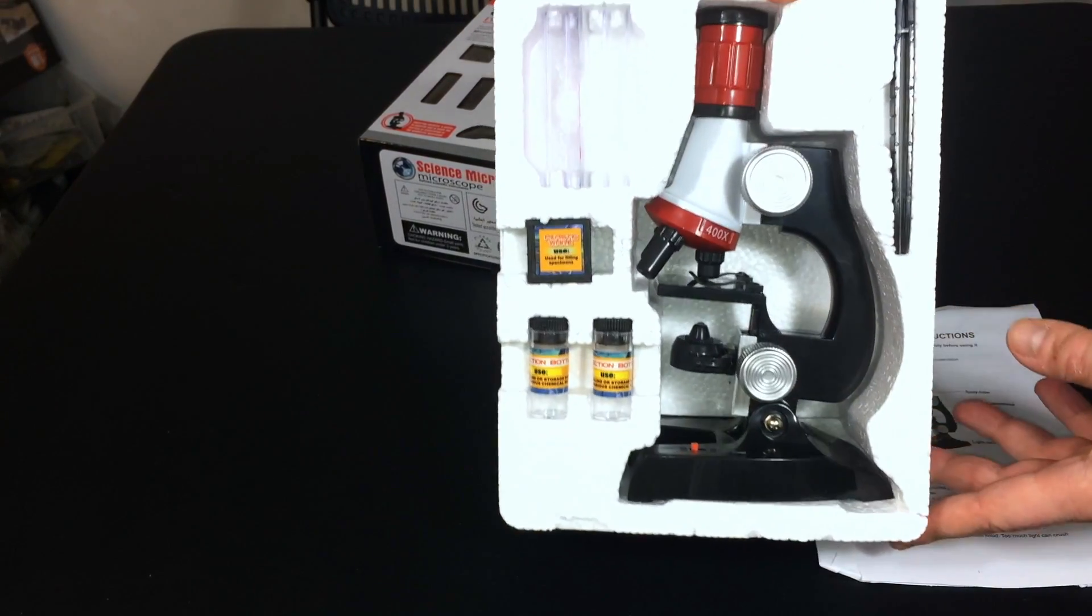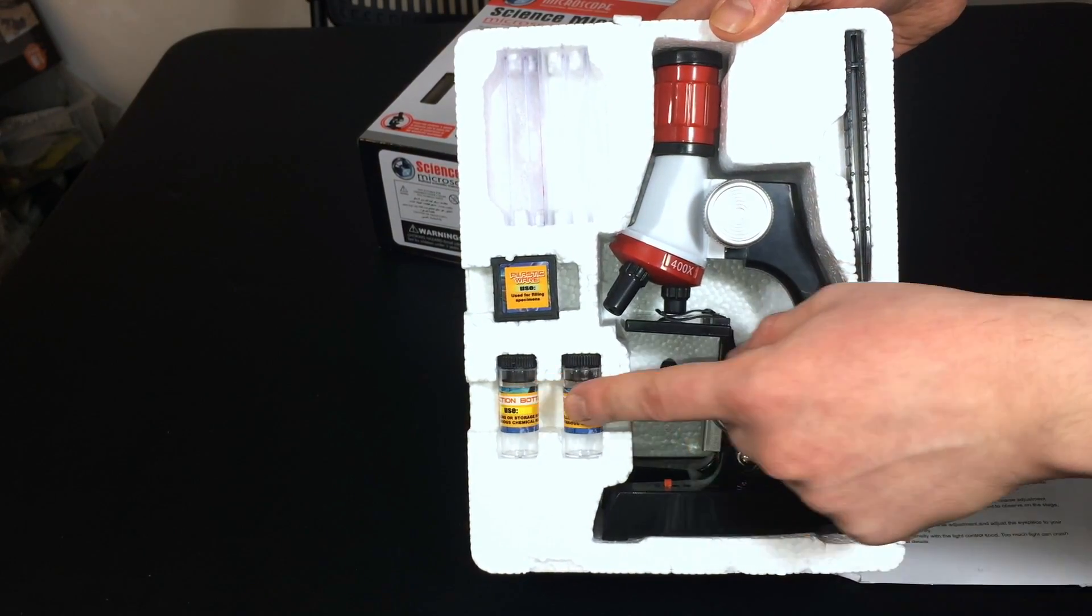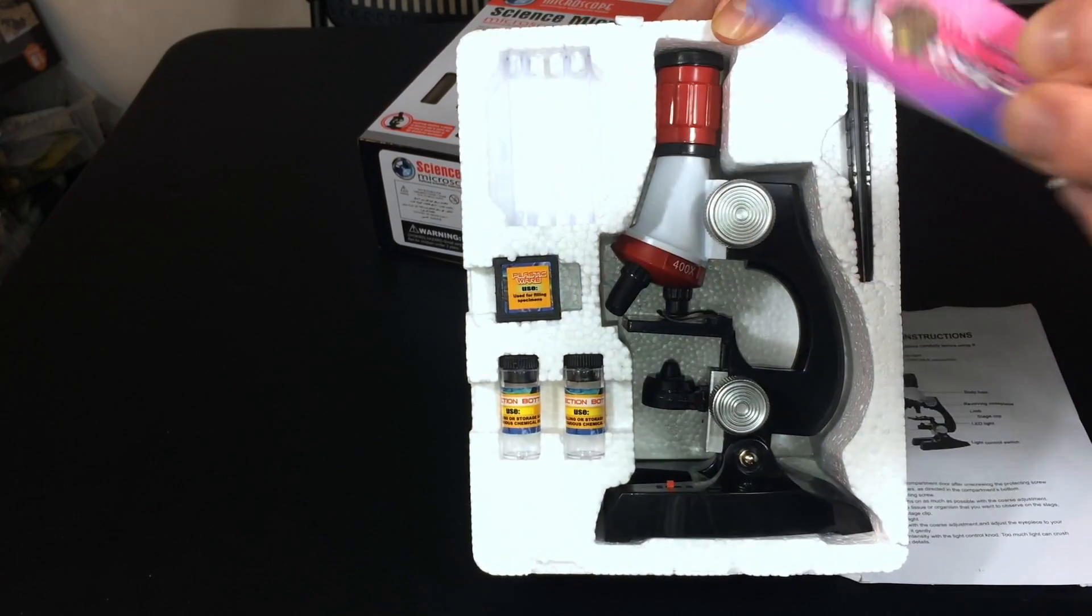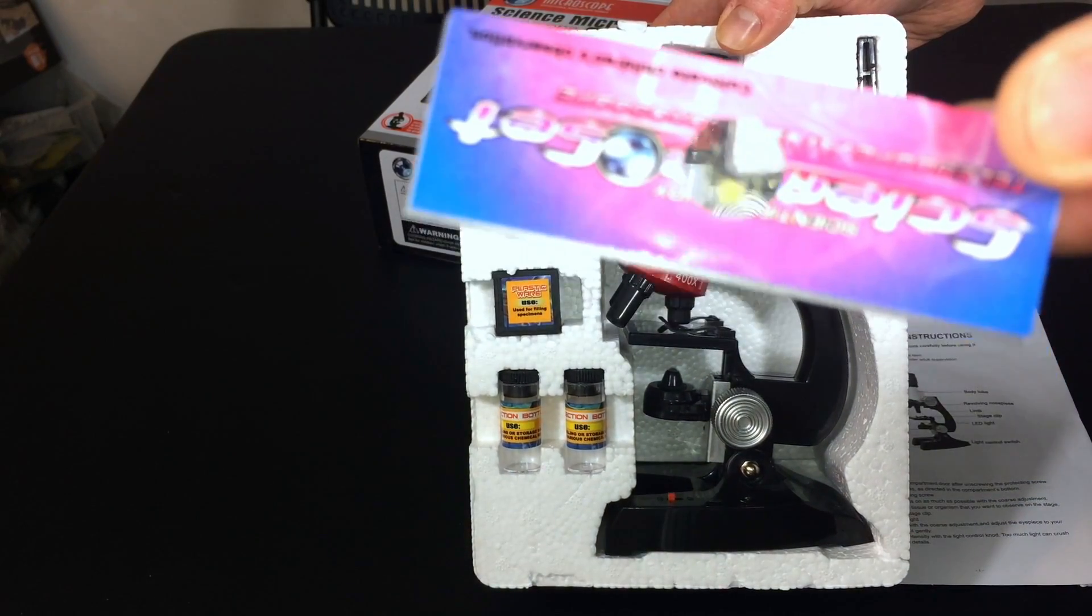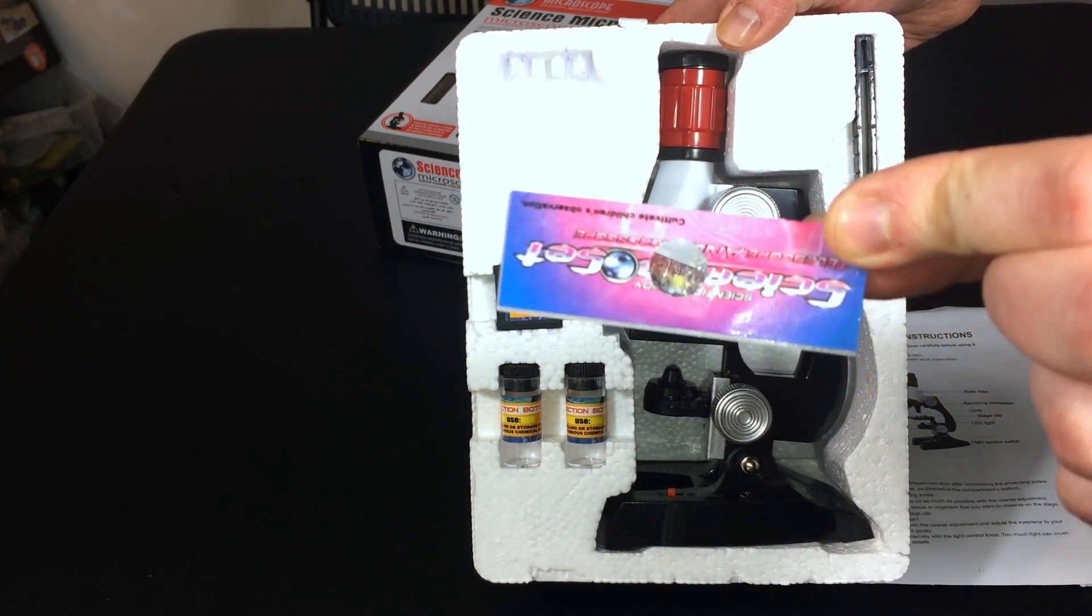Hey guys, so this is what we get. You have everything I've described. Tweezers. We have a couple of test tubes here. We have some slides. It looks like this one right here in the middle already has something on it. And we're going to check out what that stuff is inside. It looks like some kind of a fiber from something, but I'm not quite sure.